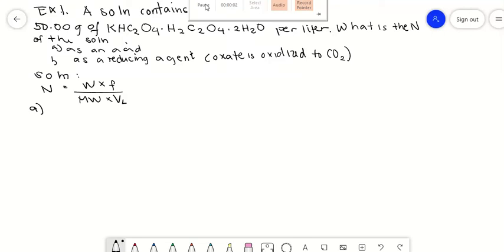So, in redox titration class, in the oxidation process of volumetric analysis, standard solutions of oxidizing agents and of reducing agents take the place of the acid and alkali solutions of the neutralization process already studied. So, take note that from our previous lesson, we have the titration of acid and a base to have a neutralization process. So in redox reaction, we have already the oxidizing and reducing agents. So this takes place of the acid and the base or the alkali solutions.